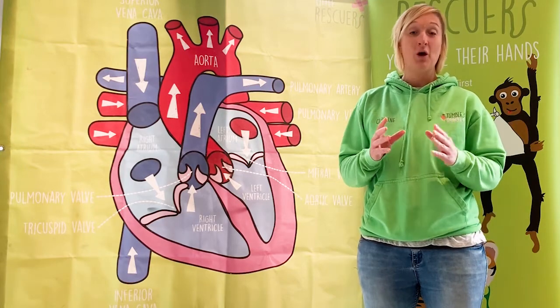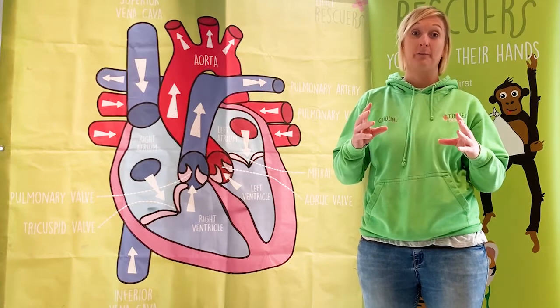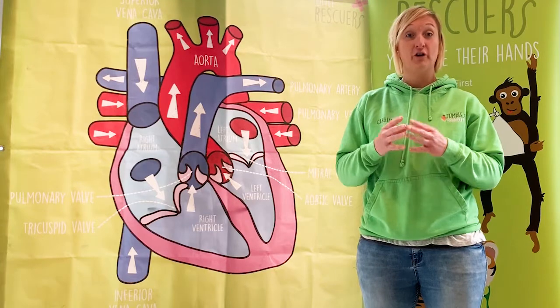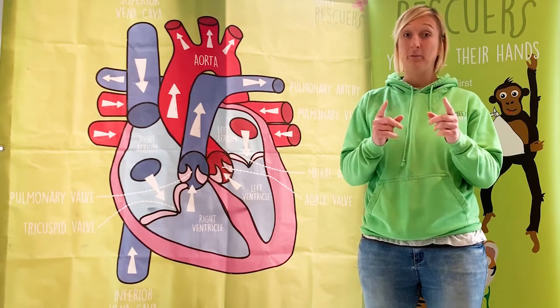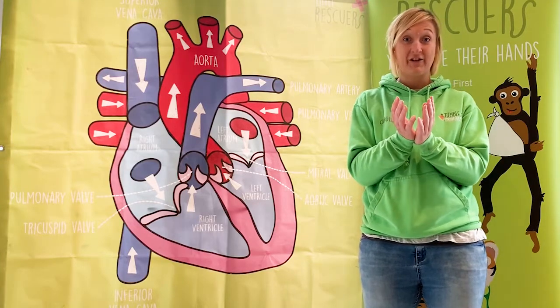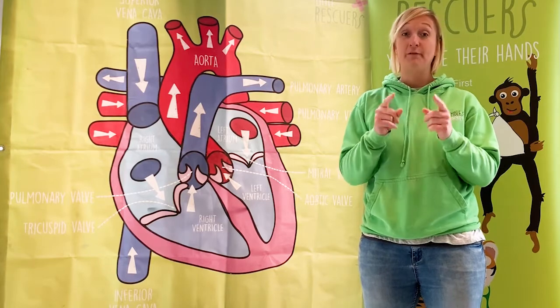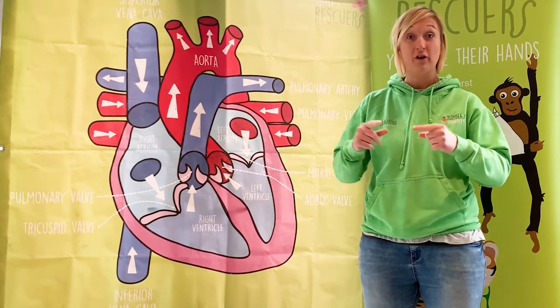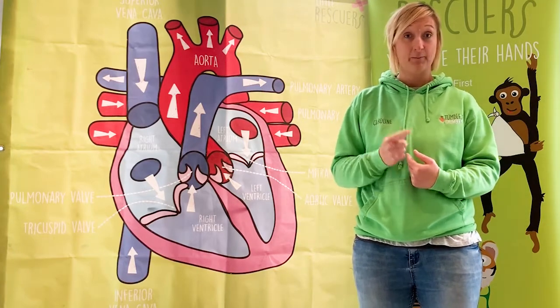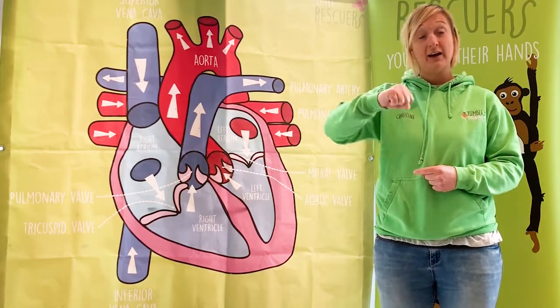So today we are going to have a look at and dissect a heart. It's not a human heart, but it's a heart of a sheep. In a little bit we will have a look at that and we'll cut it open and we'll see what it looks like inside, because a sheep's heart is really similar to our heart. But first I just wanted to show you guys what our heart looks like on the outside, but also on the inside. Okay, so our heart is about the size of our fist.